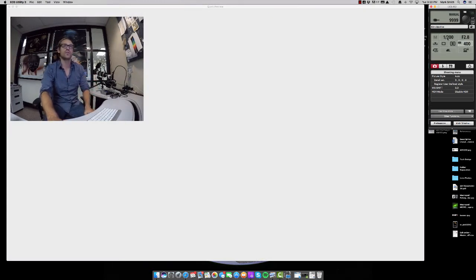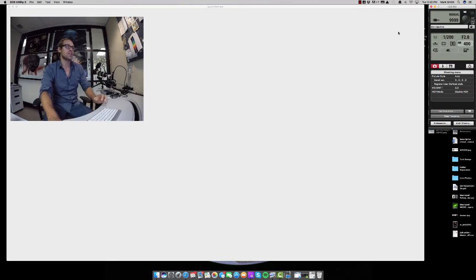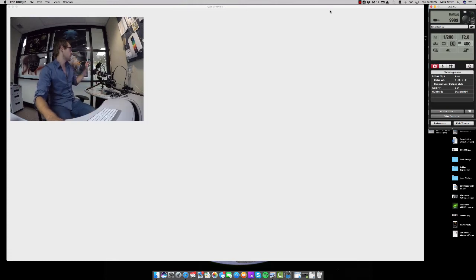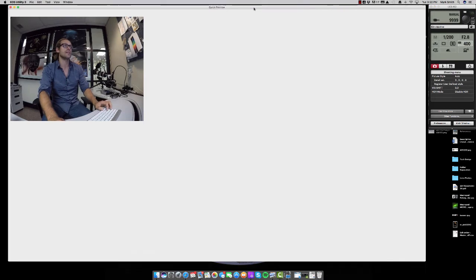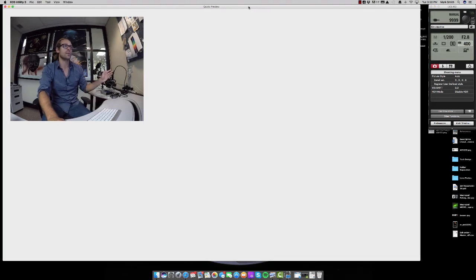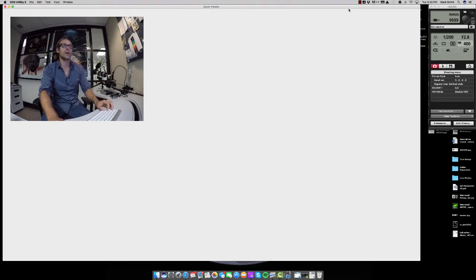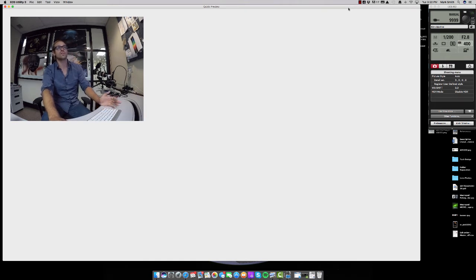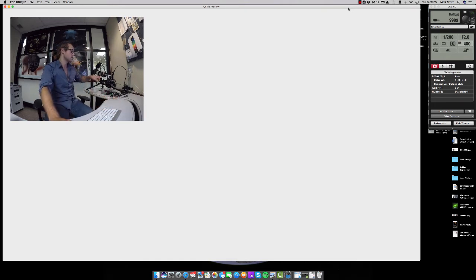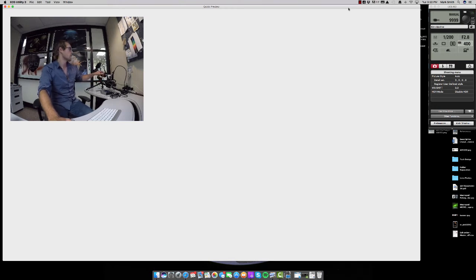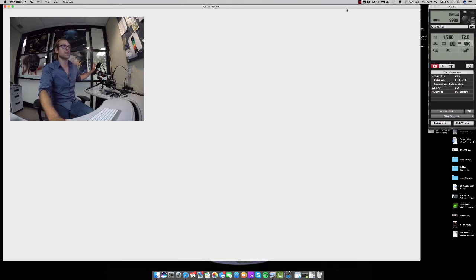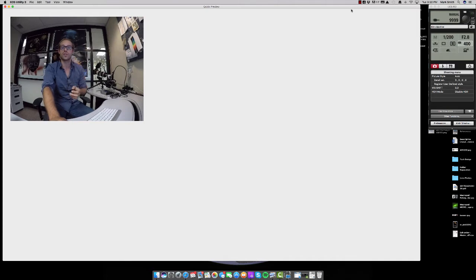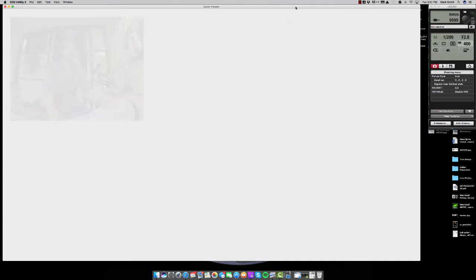Exposure doesn't change, one over 200, aperture doesn't change, f 2.8. And the flash is going to maintain, you're going to be at one over four. And one over four, one over two is usually what you should be using whenever you use a 50X or a hundred X objective. And if you are using the hundred X objective, same diffuser, just probably use one over two on the flash output and adjust your ISO accordingly.